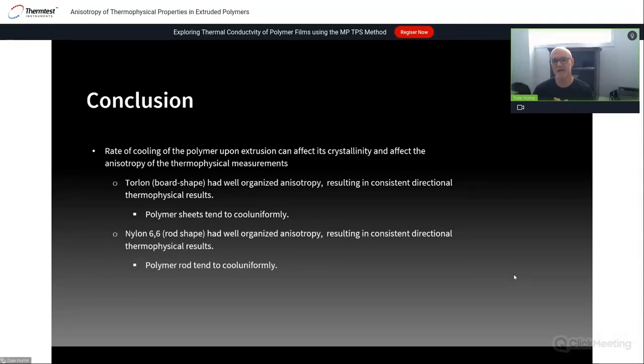Yeah, I guess I didn't mention that if you Google Nylon 66, there's a question. This is question time. I'm just jumping into that, Angela. Hopefully it's okay. That range, you can see anything from 0.29 to 0.36 watts per meter Kelvin, and maybe even a little lower. Some of that, again, is just Nylon 66 made by different companies, but certainly anisotropy can be a very specific effect on the values that are measured by various methods.